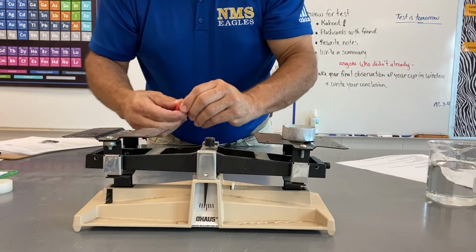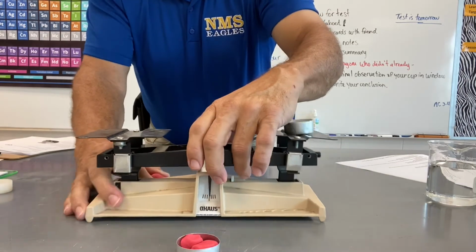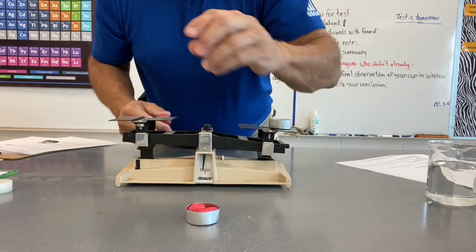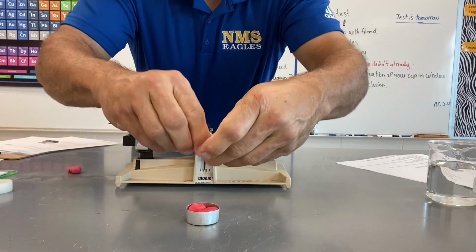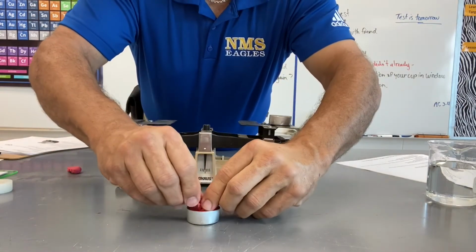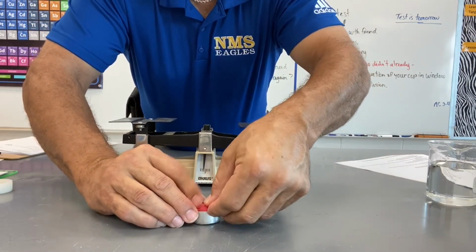The difficulty is that the cup is pretty fragile. Oh, sorry about that. The cup is quite malleable, we could even say. It is made out of aluminum, so as I'm mashing things in there, I'm altering the shape of the cup a little bit, which is not something I really want.